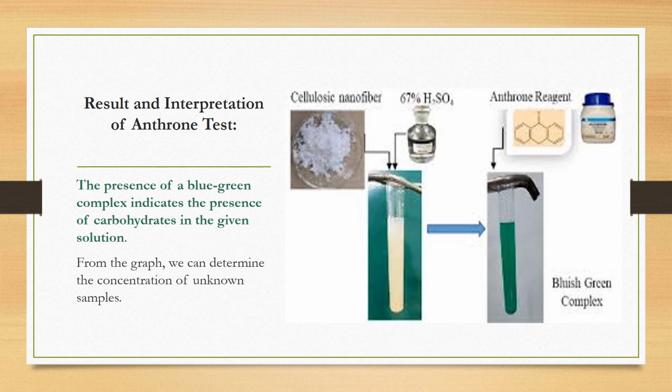You can see the solution formed is a bluish green complex, which is a positive result for anthrone. So that means there is a carbohydrate in these samples.